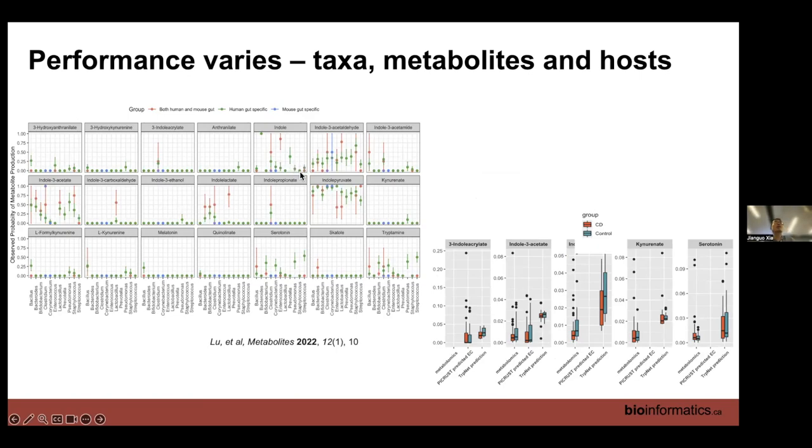We can actually measure them because we have collaborators who have the samples. We can test them, and we tested a few of them. We also compared with popular tools used for this kind of prediction, such as PICRUSt and Tax4Fun. We tried, and we can actually do a better job. So at least in this case, we know we have a very accurate model, and the statistics predict well compared to most other popular tools.